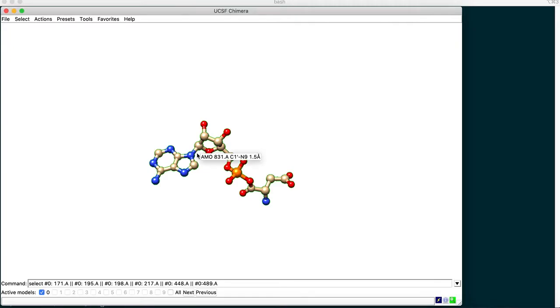And in the adenosine molecule, this part here is actually the base that has the heterocyclic nitrogen in it. The name of this base is adenine, as you might recall from the lecture slides, a particular base that's prominent in DNA and RNA nucleotide sequences.